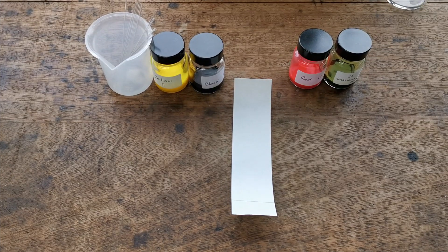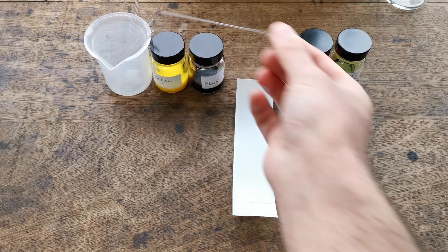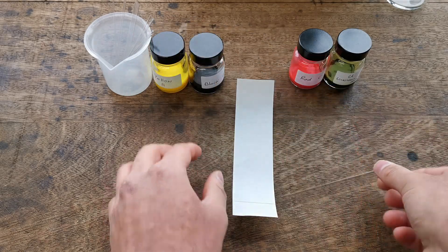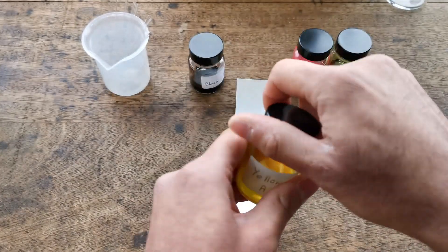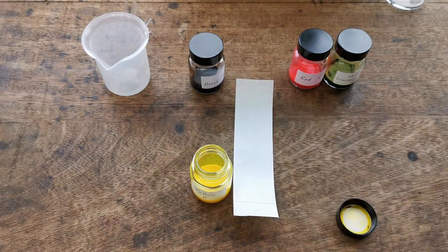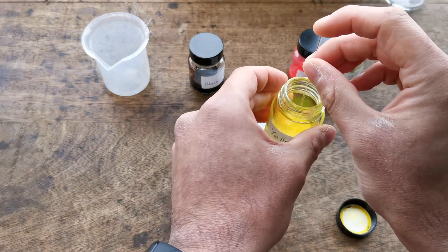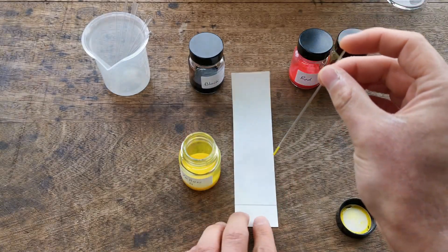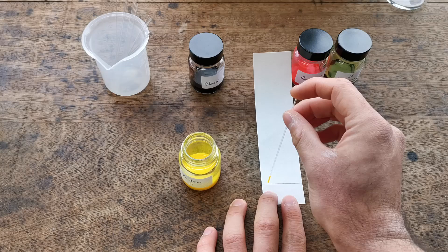Step two is to put dots of known colors and a dot of the ink you want to separate on the pencil line. We're going to be using capillary tubes for this. Starting with yellow — this is A — take the capillary tube and put a dot on your pencil line.